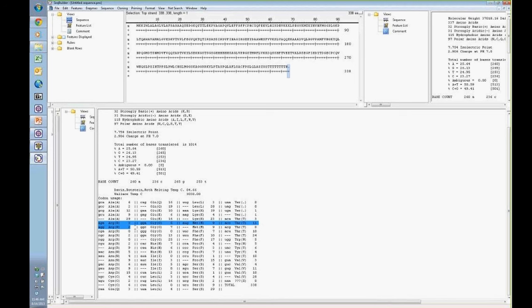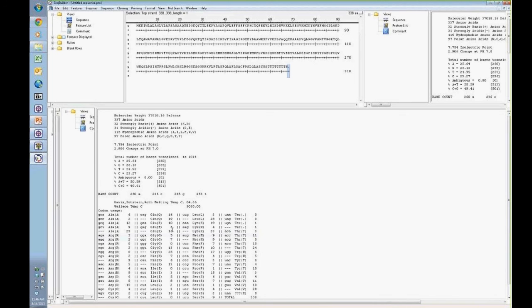So this is a very helpful interface of translation results where I can take a look at and really look into what I'm translating, what I'm seeing, and what my expected result on a gel is. If I'm seeing something interesting and unexpected on that gel, I can further extrapolate, okay, maybe it's a rare codon issue. The next thing that I try to look at, having started with some of the DNA statistics, is what we're expecting to see on the gel.